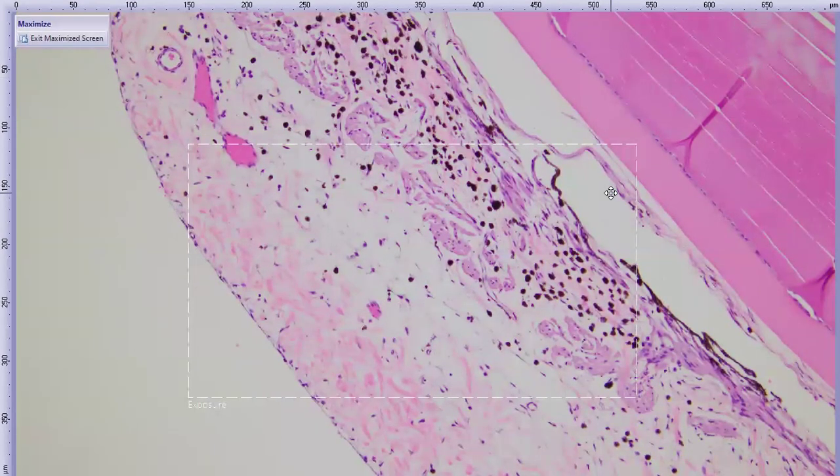We have a dorsal pigmented iris leaflet and a ventral blue iris leaflet, just like we saw in this patient grossly. So our heterochromia iridis. And what I thought was interesting as well is that the pigmentation of the choroid on each side kind of matched the pigmentation of the iris. Pretty neat.